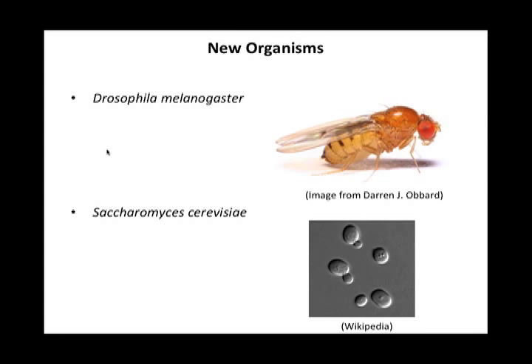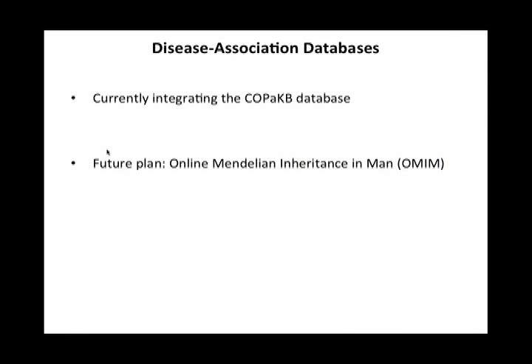We've integrated new additional disease annotation databases, so that provides more protein sets, so that we have more than just molecular functions and biological processes, for instance. We have additional input features, which I've hinted before, to cater to more PSEA-Quant users. And we've also integrated PSEA-Quant in some of the external tools that were developed in the Yates lab. And there are a few miscellaneous additions that I'm going to talk about at the end.